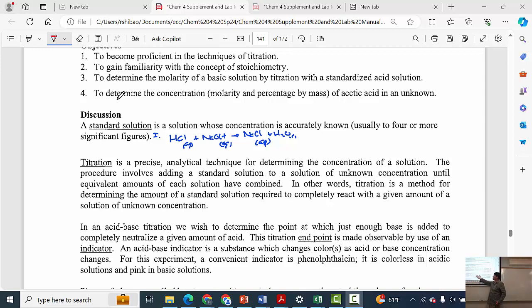This corresponds to what we call the equivalence point. But we can't see the equivalence point, so we need some way to detect it. The way we detect it is by adding a little bit extra sodium hydroxide, so little the error is negligible.